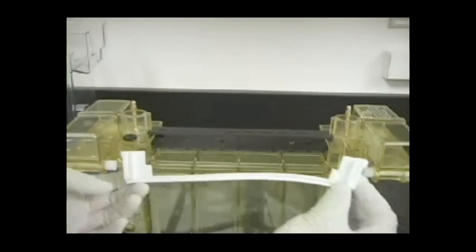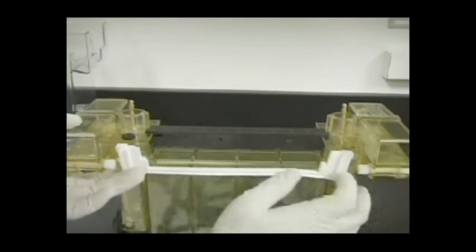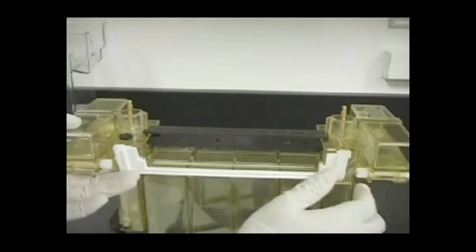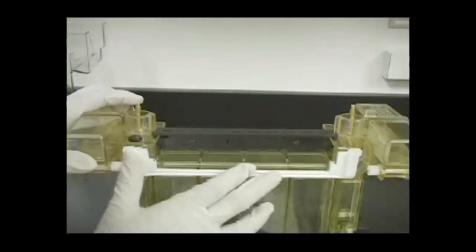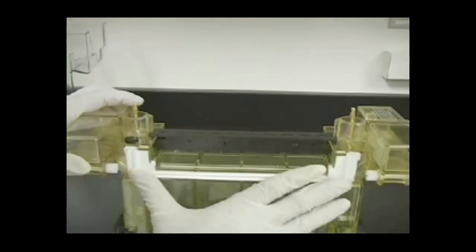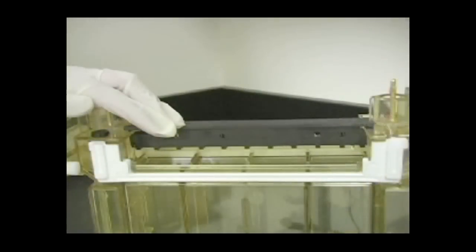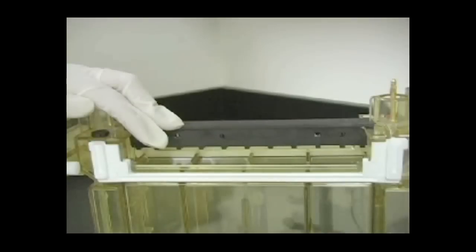After the gels are cast and polymerized, assemble the upper buffer chamber by seating the wide sealing gasket onto the central cooling core. Lubricate the front of the gasket with water or buffer to help the gel sandwich slide onto the gasket properly.